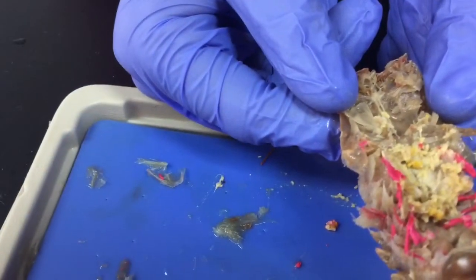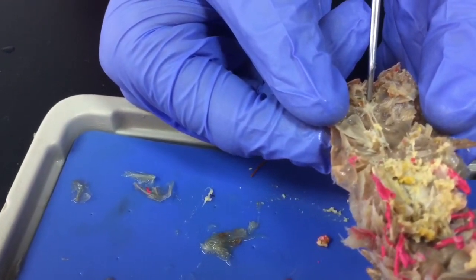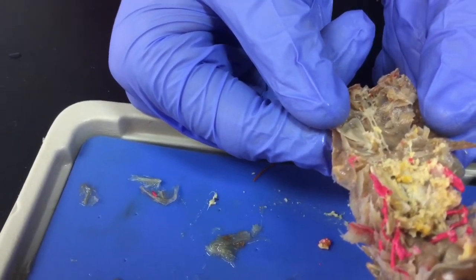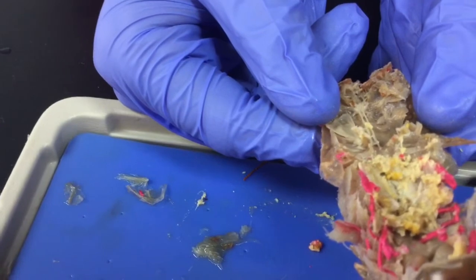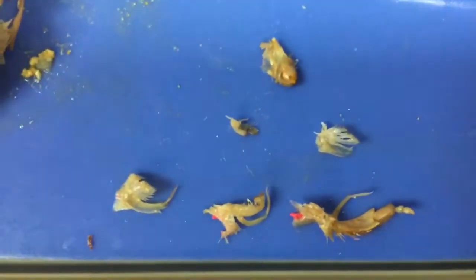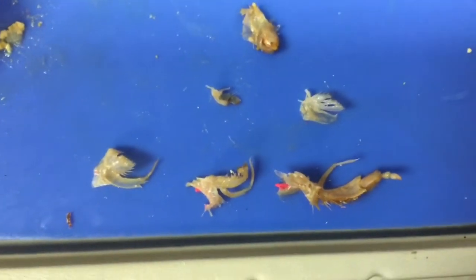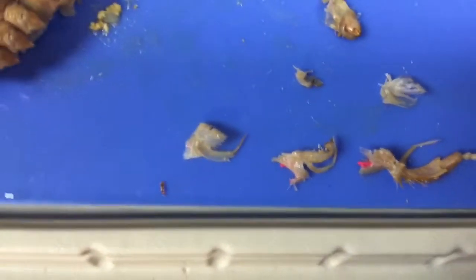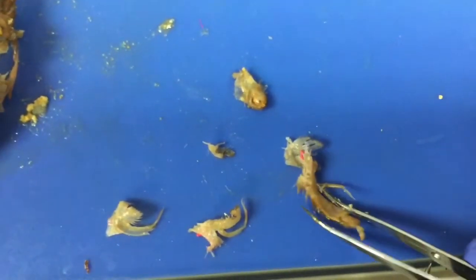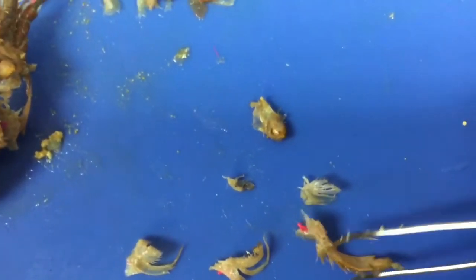Okay, we've got the brain right here. The probe is, go forward a little bit more. That tissue right there is the brain. See the strings? Those are the nerves. And you can follow the nerves running to all the sensory organs. Okay, we've pulled the mouth parts off. We've got the maxillipeds here. Oops. I'm moving them around. Maxillae, maxilla, mandible.